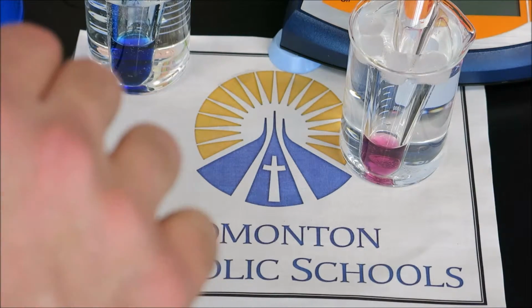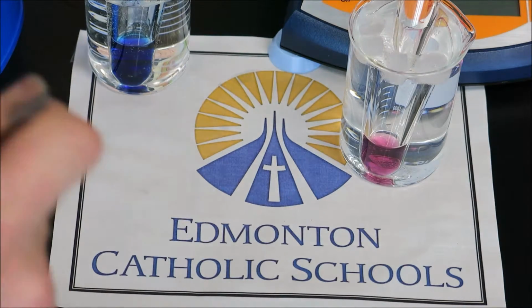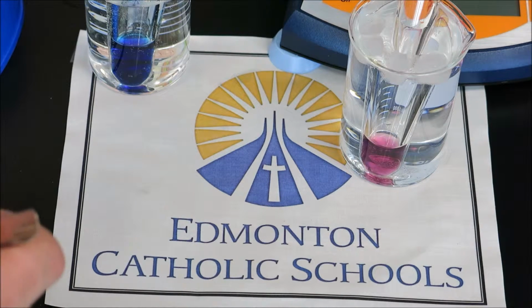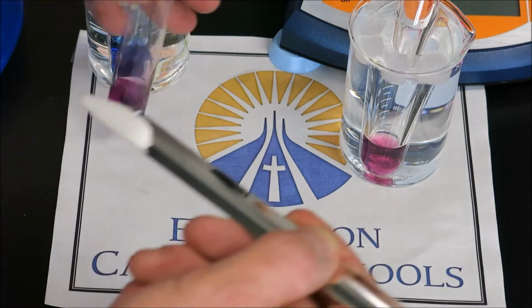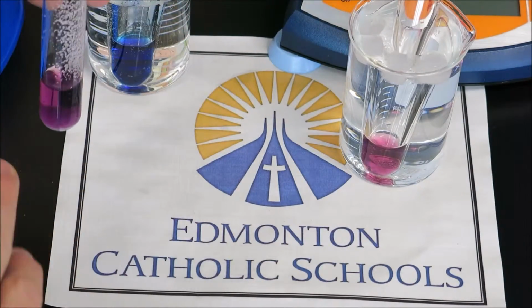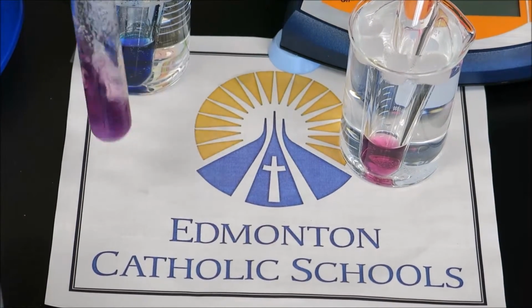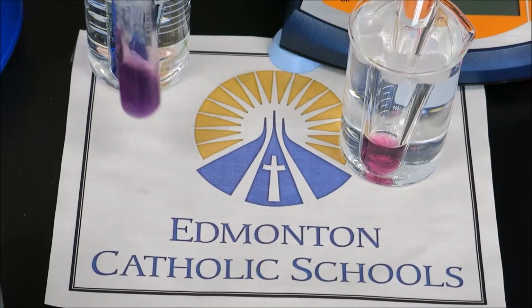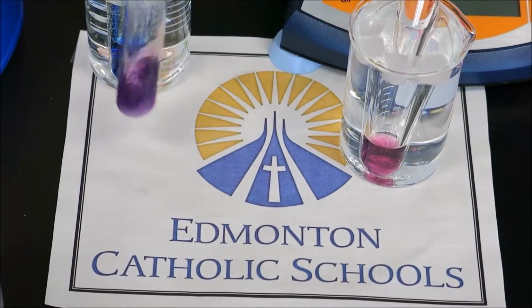Our final test is going to be adding a product. We take table salt, sodium chloride, and we add table salt to our system. Now, by adding table salt into the system, we are adding chloride ions to the system. Our cobalt complex was already quite saturated, so I need to agitate this system here in order to help force the chloride ions to dissolve into the system.